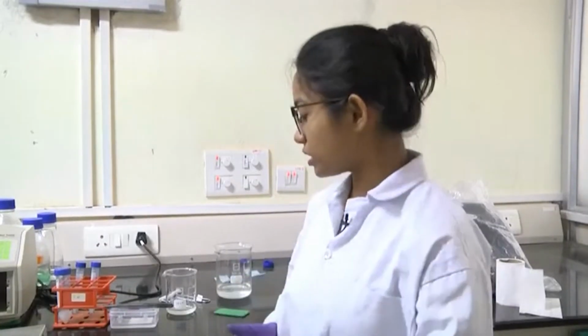There might be some problems with the blotting. So if you see that there is a huge amount of noise, again check the washing steps and the blocking solution. If you see that the intensity of the band is very low, then probably you should keep the primary antibody incubation for a longer time, because it might not be very specific to the protein. So keep it for a longer time.